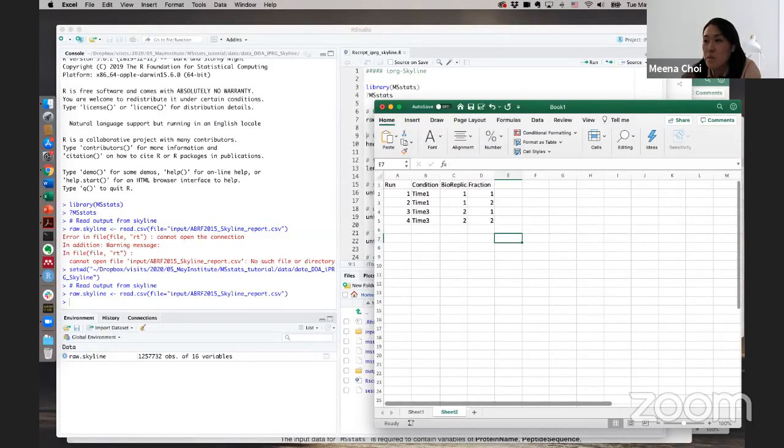For time course, should we randomize runs ahead of time? For time courses, we also assume every sample is collected, and then we randomize everything, based on the time courses and the fractionation, everything. That is kind of our randomization concept.